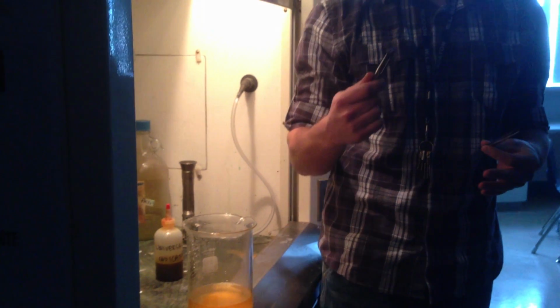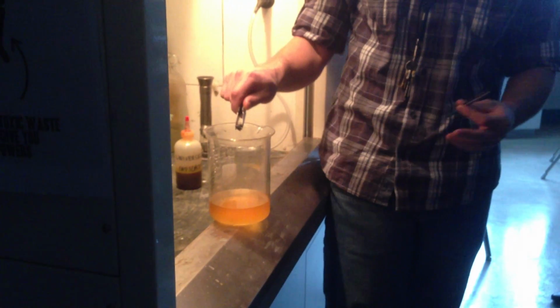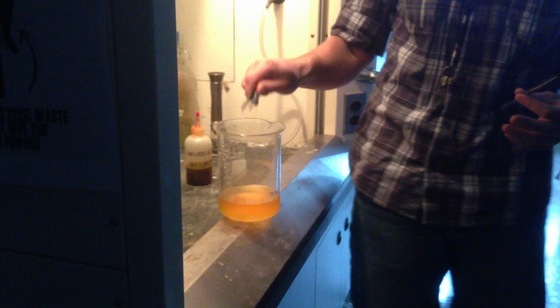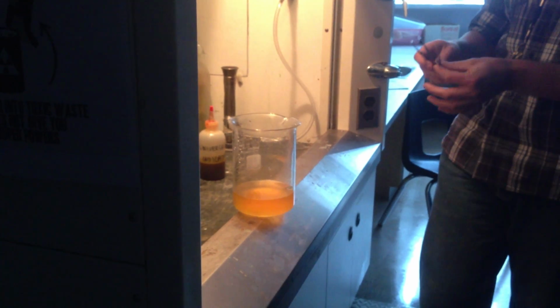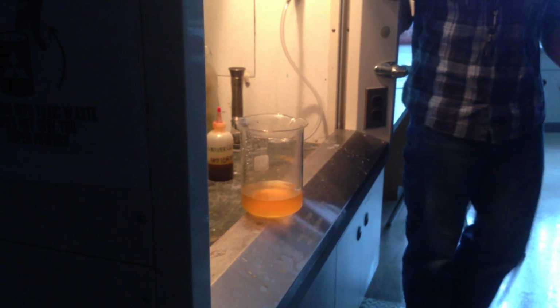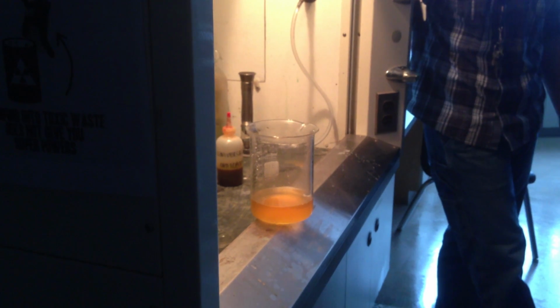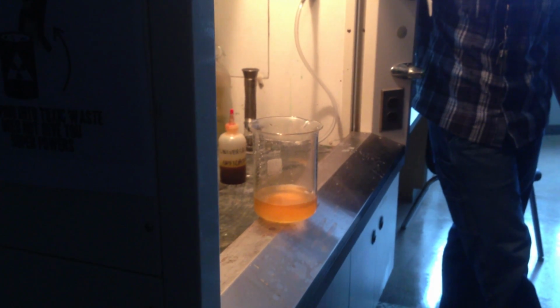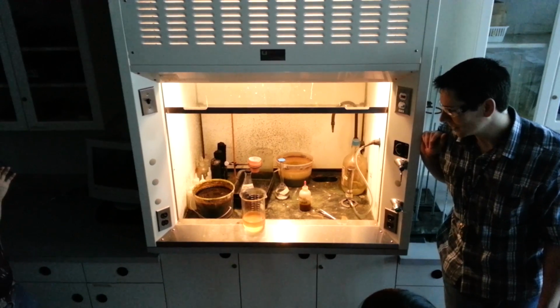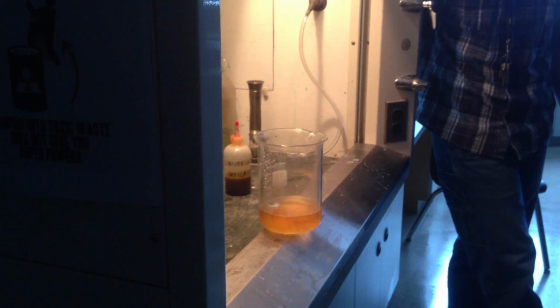It's not an instant reaction because the water has to work its way past the oil, but you'll see what lithium does in water. And if the color changes to a green or a blue, then we will have observed the alkaline nature of it. That's so fun. What's that? It just takes a minute to get through the oil, and then once it gets through a bit, it speeds up. Can we put potassium in the water? We're getting there. Okay. See that trail of blue behind it?